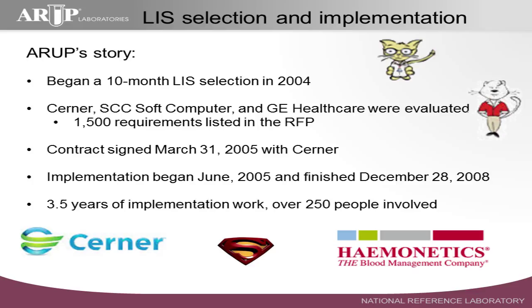For example, we have a department inside of IT, a group called Clinical Systems, and they are the ones that set up all these parameters that I was talking about for each test, and for the LIS as a whole. They're the ones who are always turning these things on and off and deciding how the rules work.